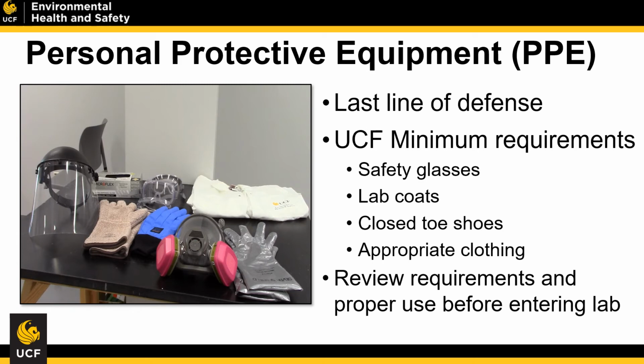We also have particular procedures for hot and cold temperature use here at UCF. If you're working with high temperatures that create large amounts of steam, we are going to ask that you wear special thermal gloves that prevent your exposure to these hot materials. Also, for steam events like use of an autoclave, we do ask you to wear a face shield on top of your safety glasses, so that steam condenses on the face shield and not onto your face. We don't want you to be exposed to any unnecessary risk of temperature burns.